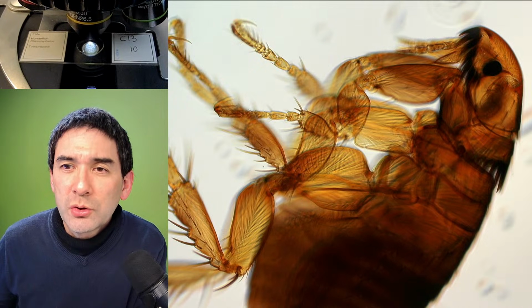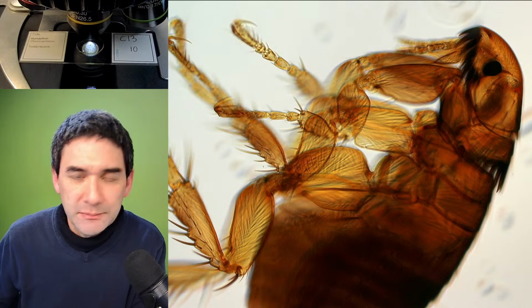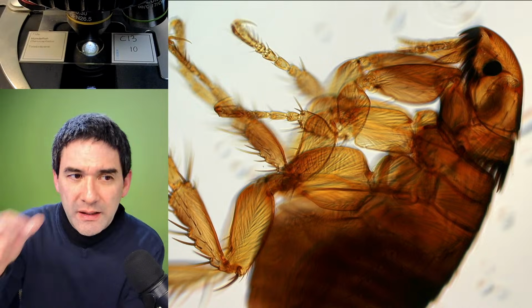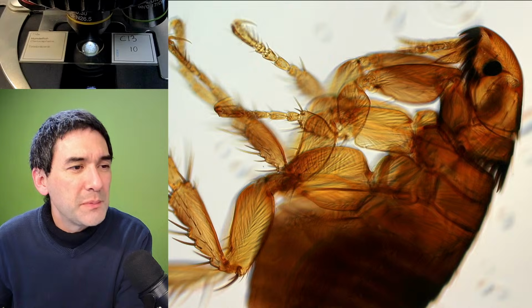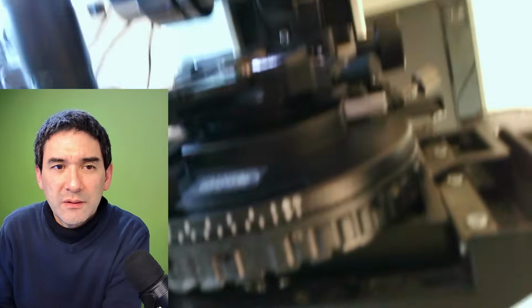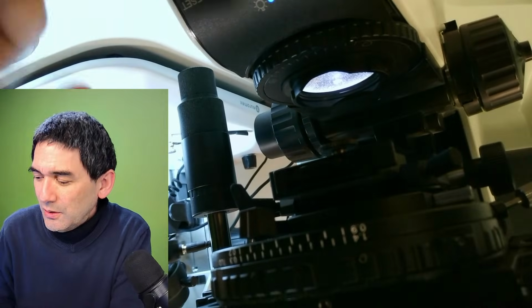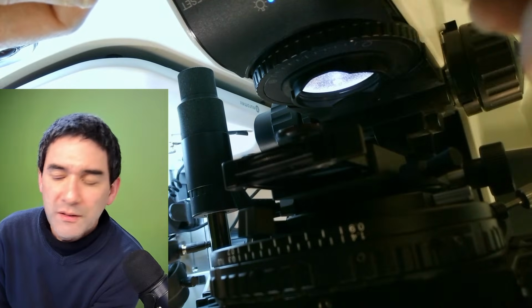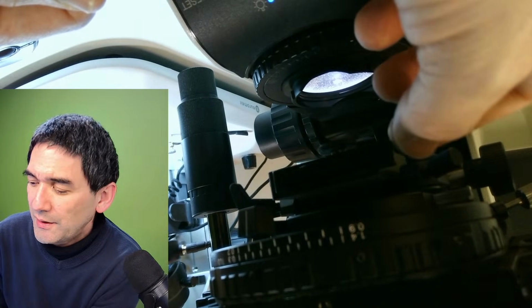Your DIC has a button to turn the polarizing on and off. Let's put it this way, it's not a button. I have several possibilities. I cannot show this to you, well, maybe I can, but it's going to be upside down. Yeah, you see, it's upside down. If I want to switch the DIC off, I just remove the polarizing filter like this. That's one thing that I can do.